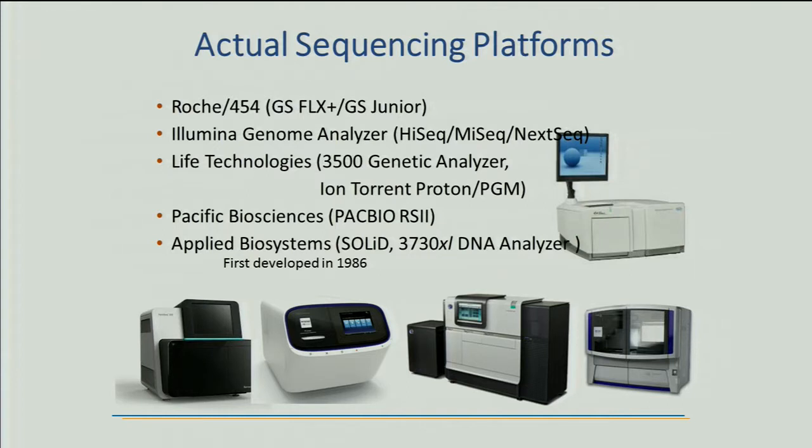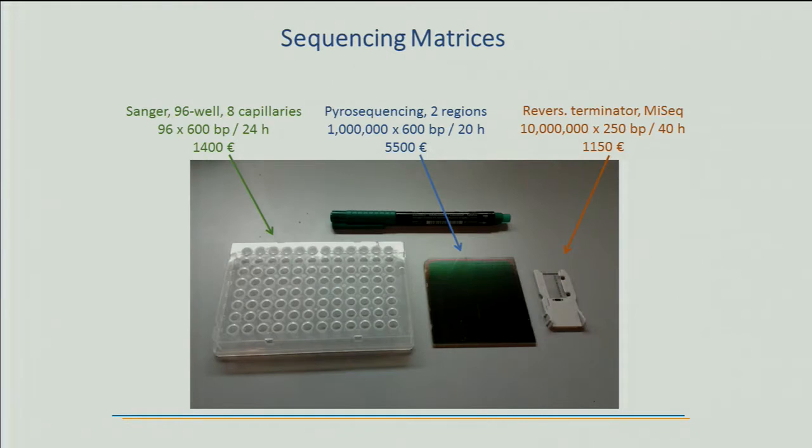This company made their sequencer, I think they started with 454, but now this is a Connecticut based company, so that's why I know that. Their instrument costs like 300,000 or something, the sequencer. Now they are integrated, right? The Life Technologies and Applied Biosystems, AB Biosystems. Yes.